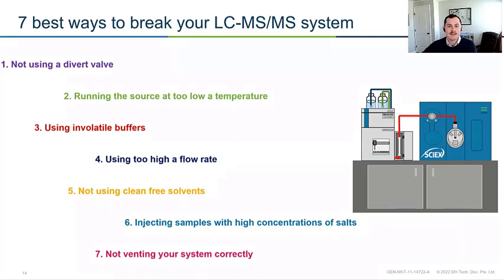So an easy mistake, but when you're building your methods, when you're going through the literature, when you're trying to really nail down that chromatography, make sure that you're using LCMS compatible buffers.